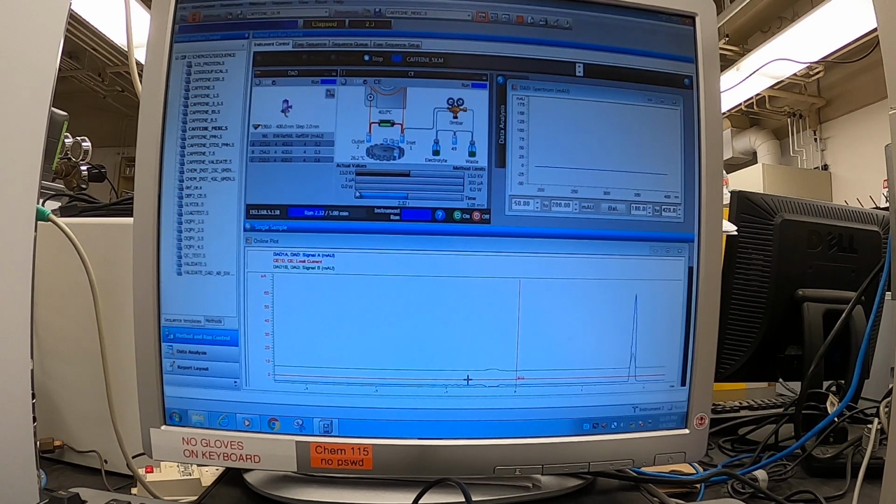But nonetheless, this is the power that you want to see. It should be up to like 16, it should be like 10 to 16 microamps. And we should see at least some kind of wattage. But usually you don't get any elution if the capillary is broken, so it's a little bit of a puzzle for me. I'll let you guys know my status updates. So that's pretty much it.